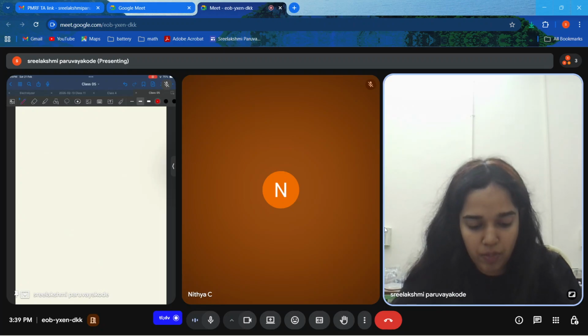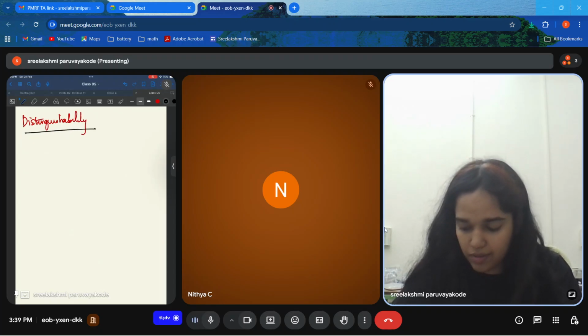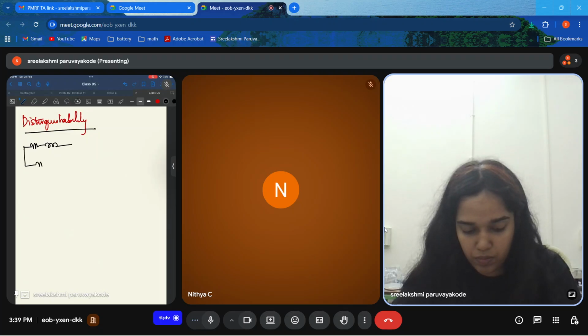okay, we'll look into the next topic, which is distinguishability. So one circuit is this one: R1, R2, L1.